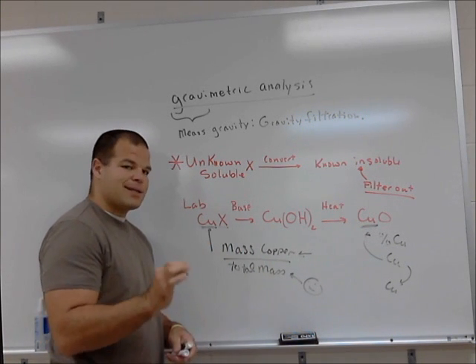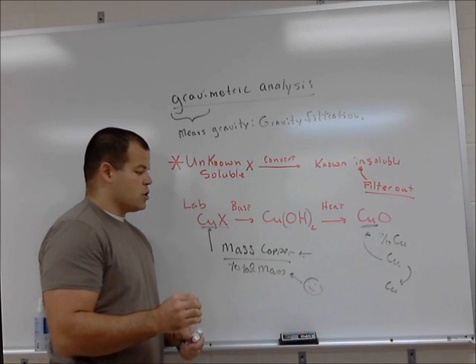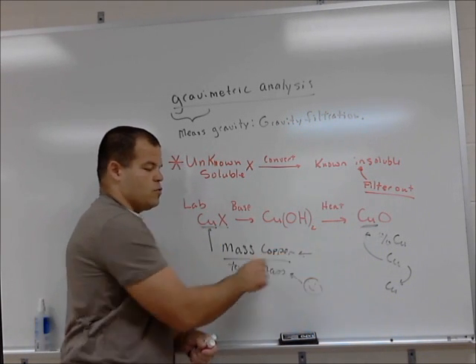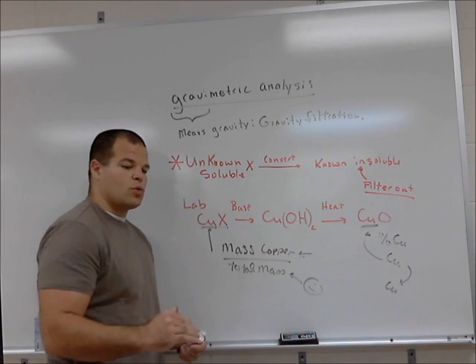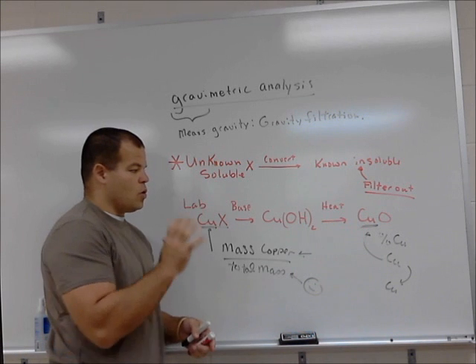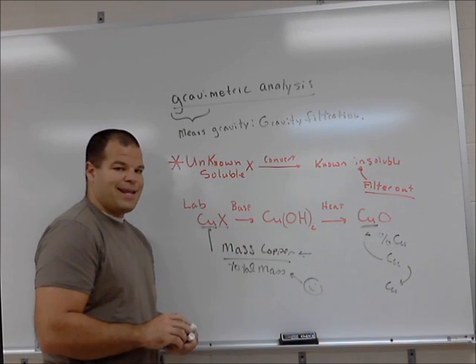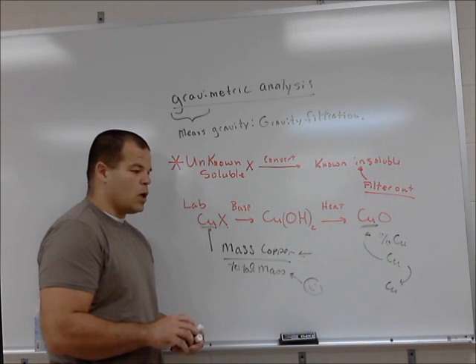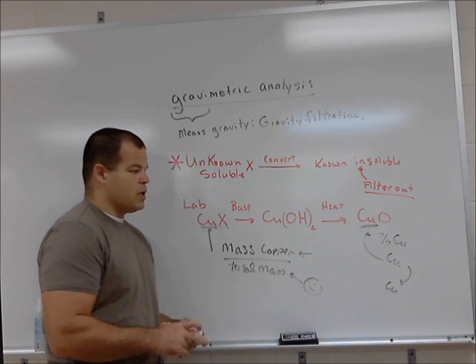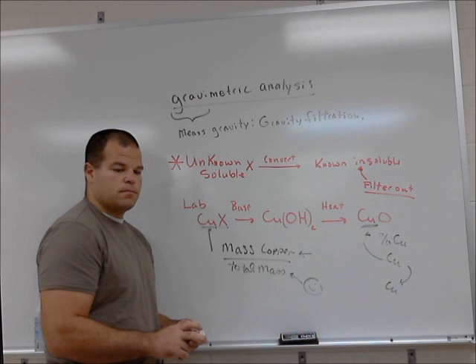Your lab has a list of possible knowns on there, so you'll just take this calculation when you add your two values, and then you compare it to a known list of possible unknowns. But we could do all sorts of analytical testing of water or various substances to determine unknown entities.